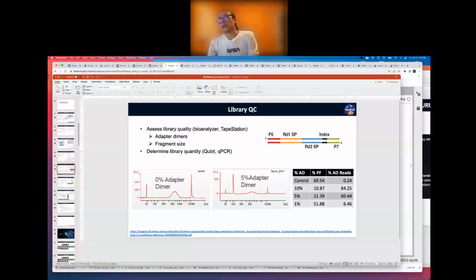But yeah, that's what we do, and then we run that initial sequencing run on the iSeq to get a small number of reads per sample just to see how it's panning out, because of the bias that shorter fragments are going to latch on more easily. So if you have a library with shorter fragments, you're going to get more reads from that sample than from a sample that might have larger fragments.